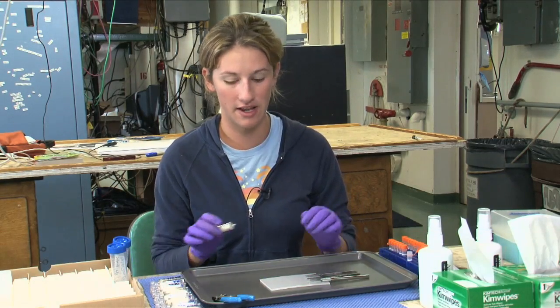Hi, I'm Caroline Fortunato, and I'm from the University of Maryland, Horn Point. And I'll be showing you our first step in extracting our DNA.